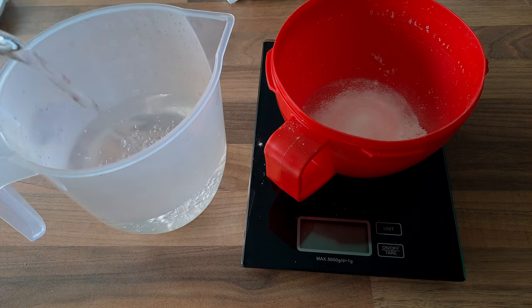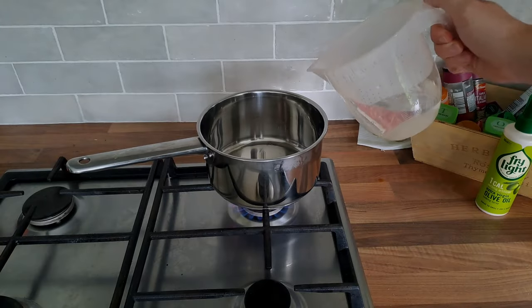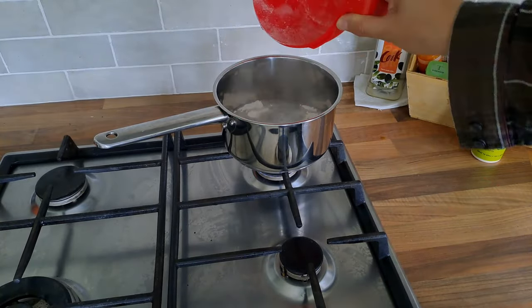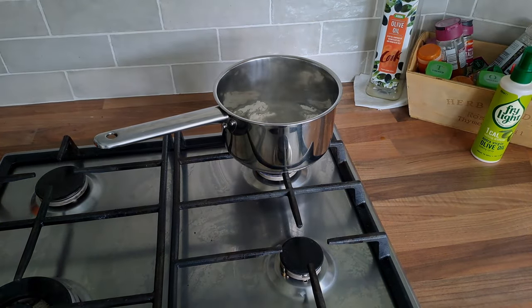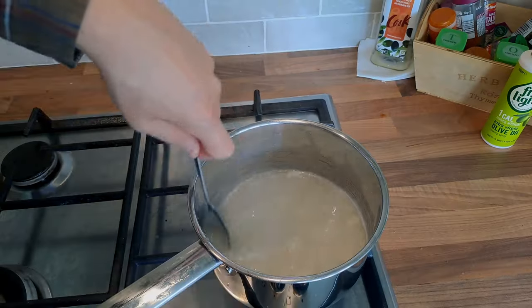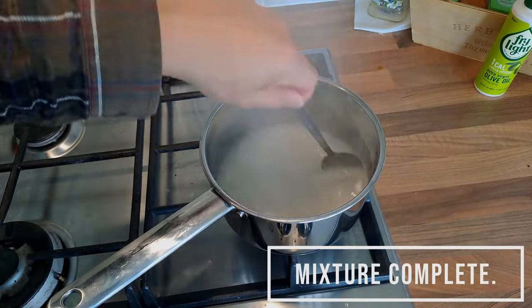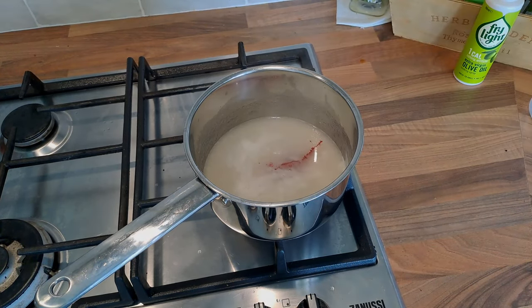Next, measure out 400 milliliters of boiling water and then add it into a pan. Add the mixture into the boiling water and then stir continuously until it's all mixed. When the mixture starts frothing like this, it means the agar has correctly activated and the mixture is ready.